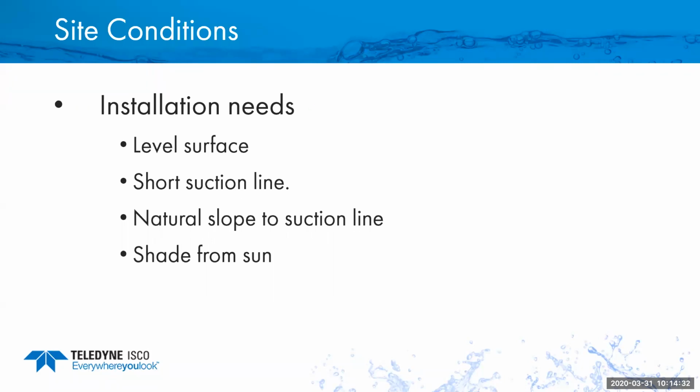It's a very common thing we see when you have them in manholes. You're hanging them in a manhole and suspending them. We definitely want to get that as level as we can, that way it hits all the bottles. If it's a composite situation with only one bottle, we're less concerned with level, but it always helps for filling the bottle.